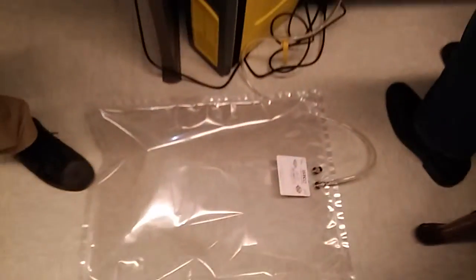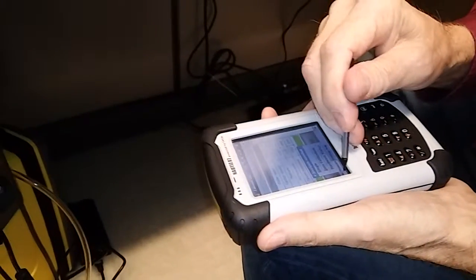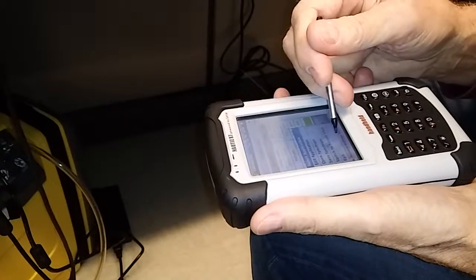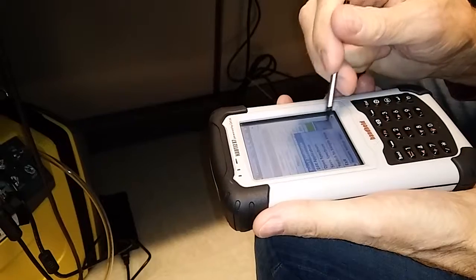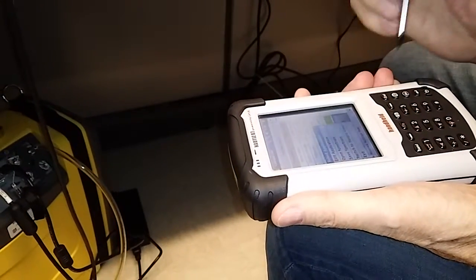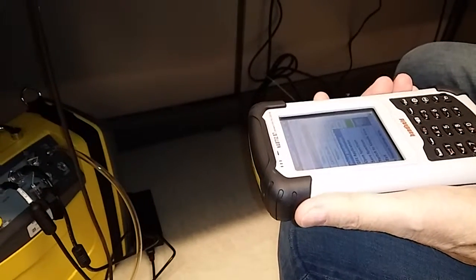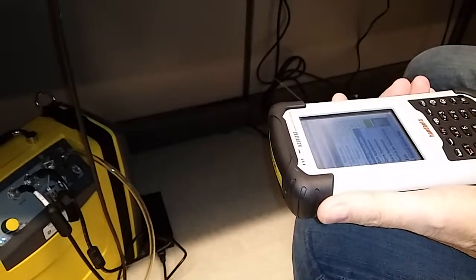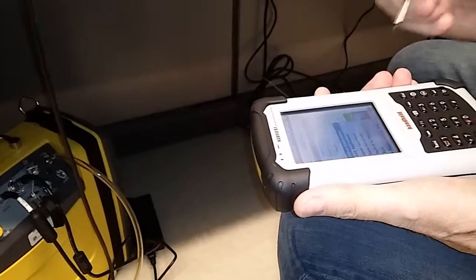You can basically take continuous measurements too, if you want. I don't know how to do the spectrum yet, and I don't know about the other ones. This has limited capability with the PDA. We would have maximum capability because we ordered the extended library using the computer, but now I can't load the software on the computer because it won't let me.